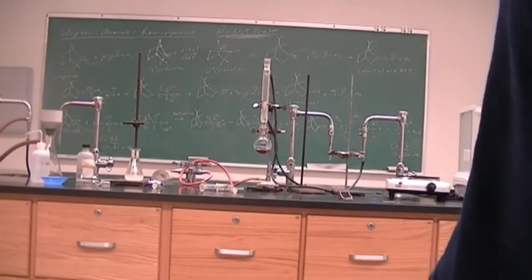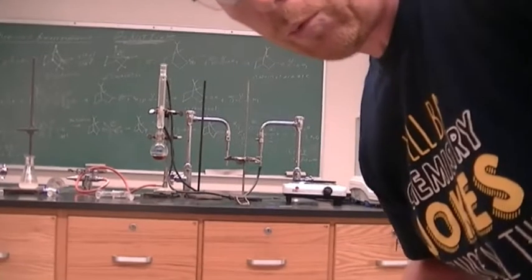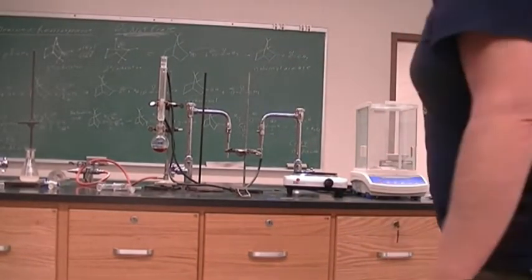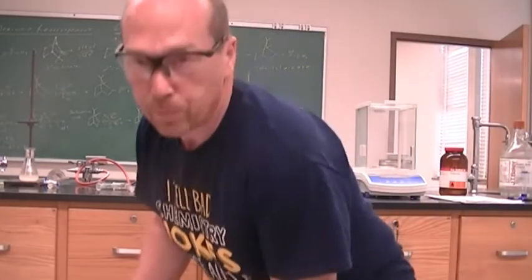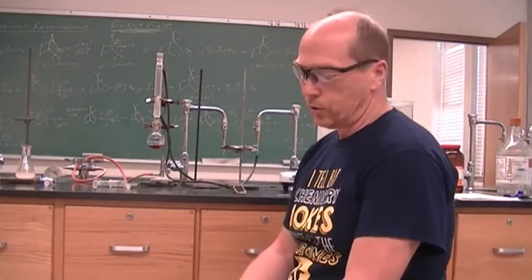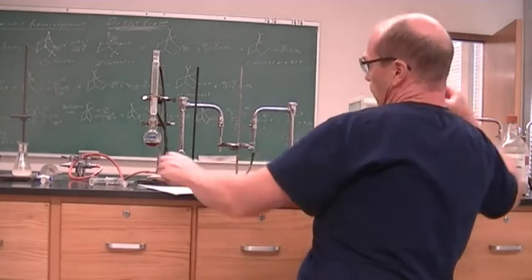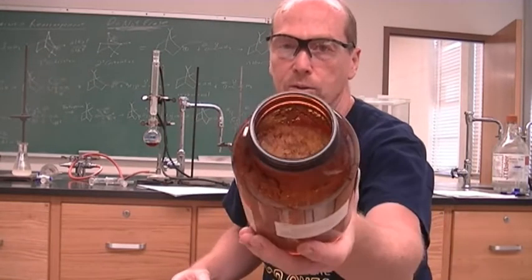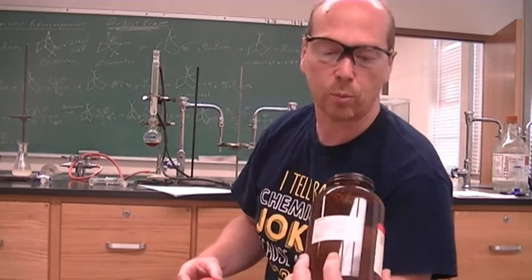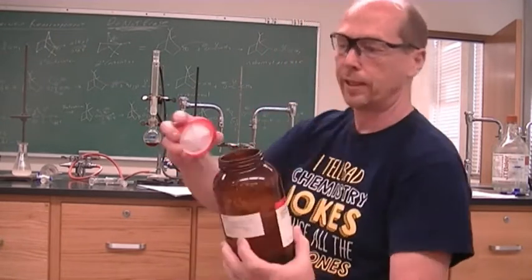All right, so I've started the experiment. And let's see where we're at in our experiment. In our experiment so far, what I have done is I took 3.2 grams of our camphene. All right, so camphene smells like Vicks, kind of more solid than a Vicks. All right, and so here is our camphene.